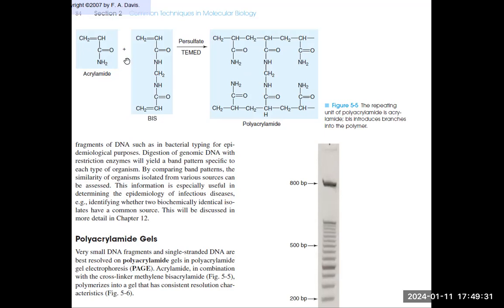However, unlike agarose, which just polymerizes upon cooling, like our gulaman or gelatin at home that we just let cool by itself to harden, with polyacrylamide gel we need a catalyst so that polymerization can proceed, in the form of nucleation agents or light activation.